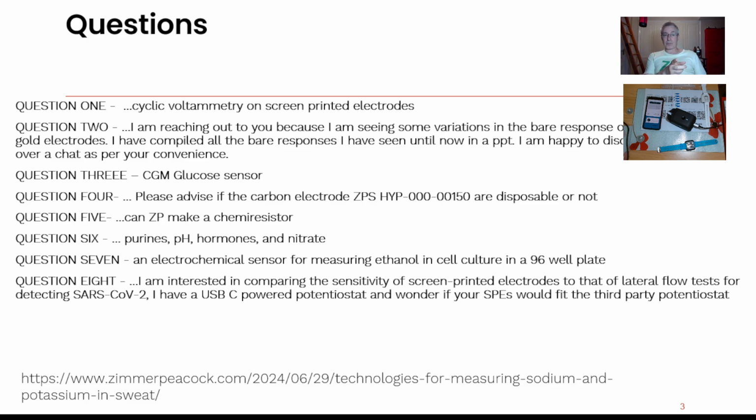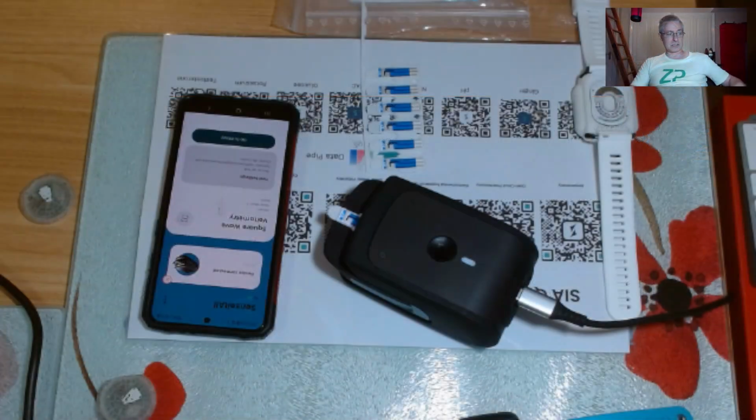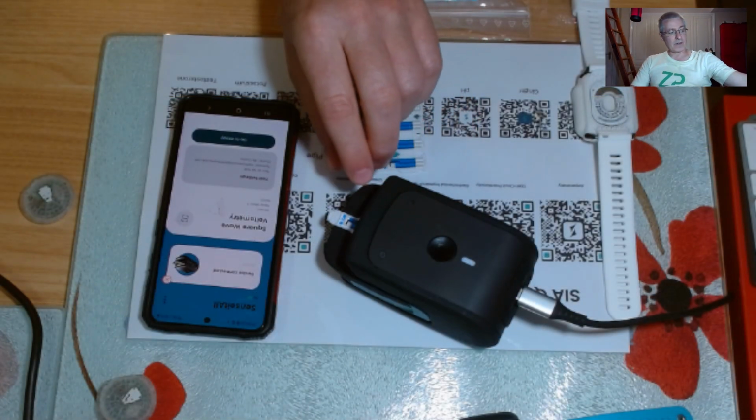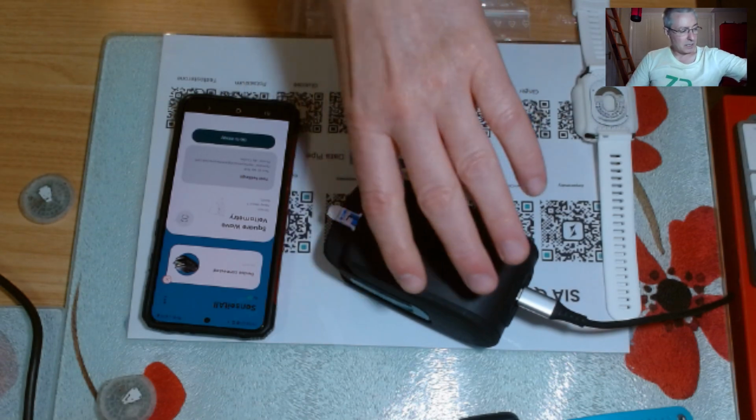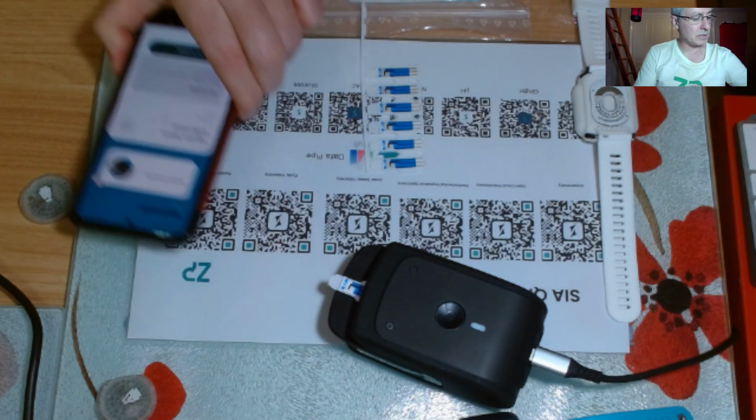By the way, question number 3, they are also using a potentiostat that does have a known compliance potential issue as well. I will just share. Of course I'm much more keen that people don't use the third-party potentiostat in question number 8, but I'm also a manufacturer of potentiostats. If I was going to do what they were going to do, I could quite easily do it on this particular potentiostat, especially as they're probably going to end up doing things like immunoassays.